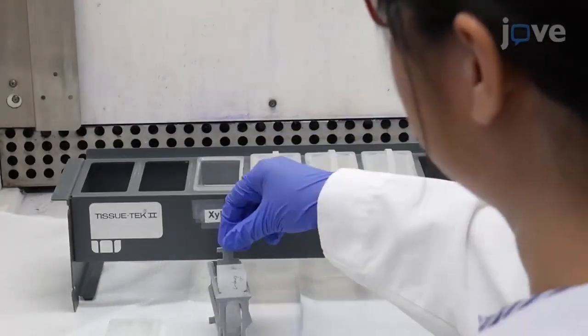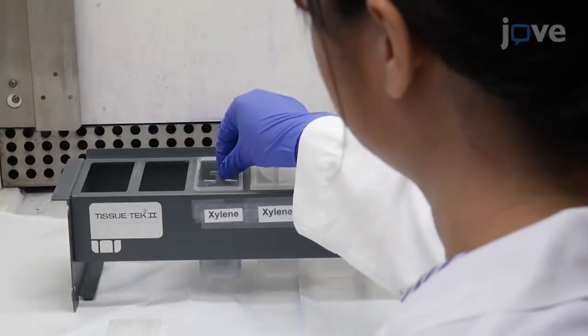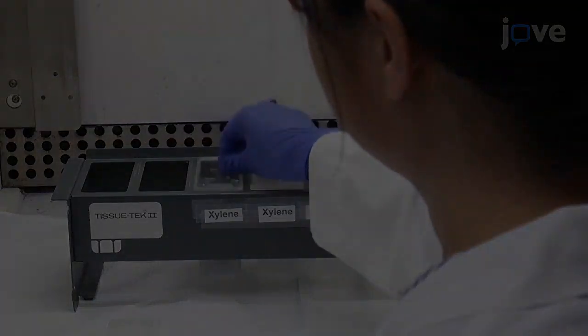Next, place the washing rack in a xylene-containing dish and incubate for 5 minutes while moving the rack up and down.